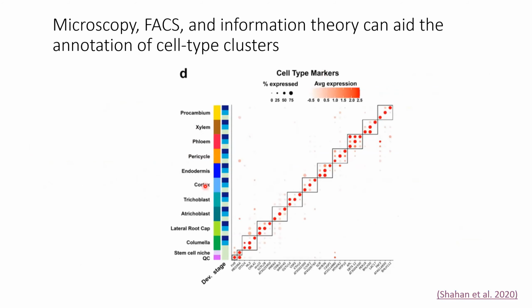So one question you might have is, can we use marker genes to do a better job at clustering cell types? And yes, there are a number of clustering algorithms that prioritize cell clustering partitions where the average expression of marker gene expression aligns with the cell clusters.